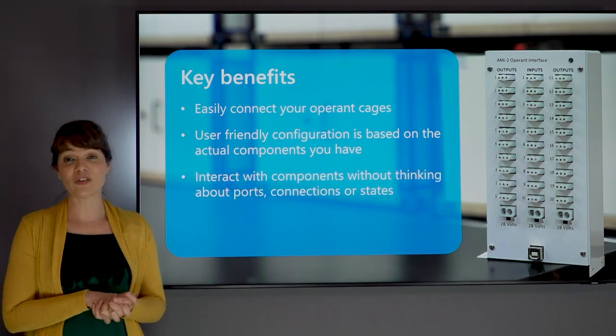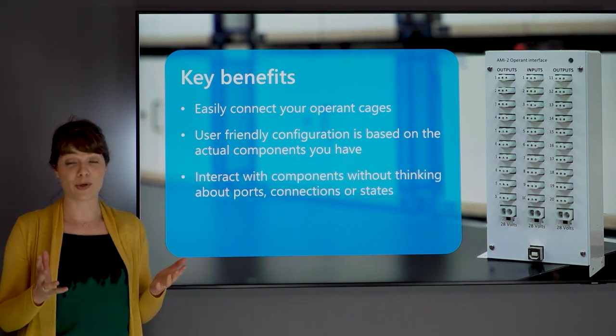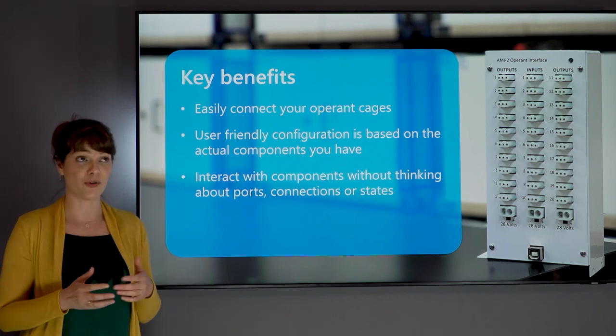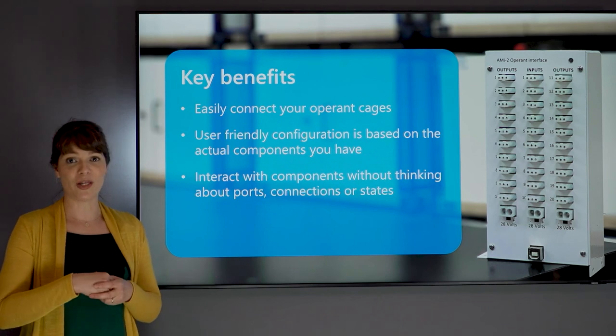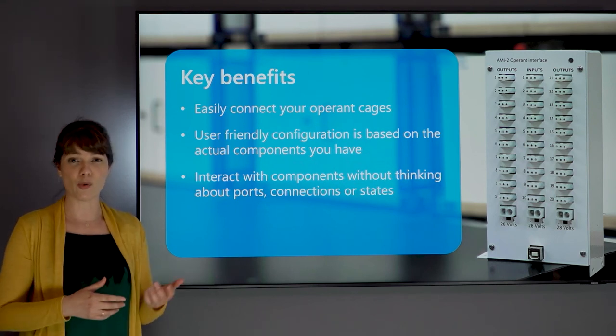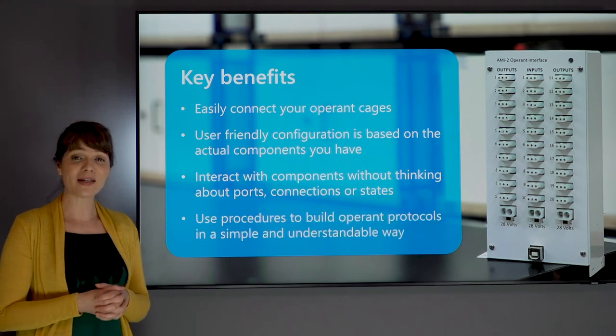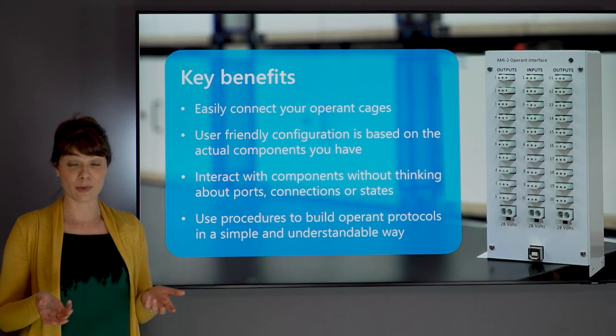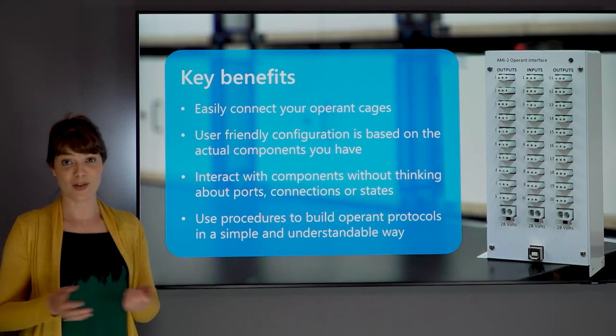With Anymaze, it's easy to build a protocol. It's very straightforward, as you can interact directly with your left lever or with your food dispenser without having to think about connections or ports or states. And finally, Anymaze's powerful procedures allow you to build sophisticated protocols in a simple and understandable way.